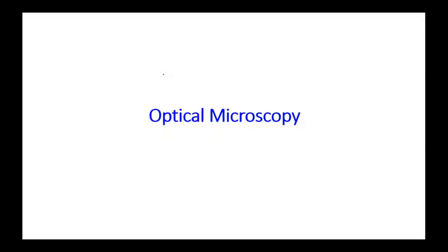Good evening, everyone. Today we'll start with the next topic, optical microscopy. Optical, as we all know, deals with visible light. In general, in microscopic techniques, by visible light we mean 400 nanometers to approximately 700 nanometers.